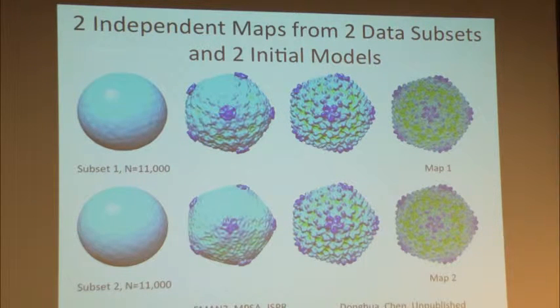But then you do these alignments and refine the particle orientations with more and more particles, and features will become more and more visible. So eventually, at the end of the analysis, we have 2 density maps. I will get later on to why 2 density maps are important, because from each of the density maps we can build a model, and we can estimate how similar these 2 maps are to make an estimate of the resolution.